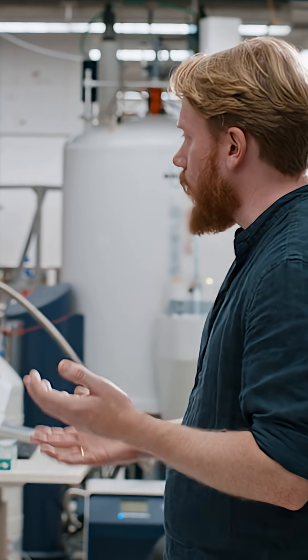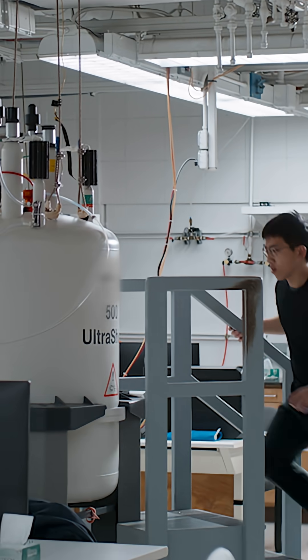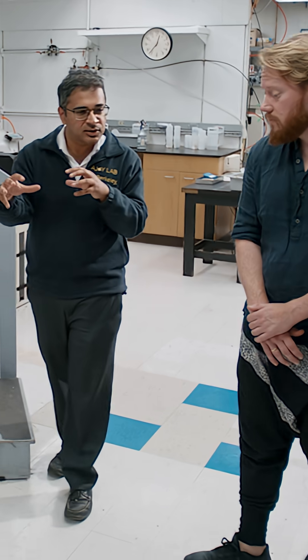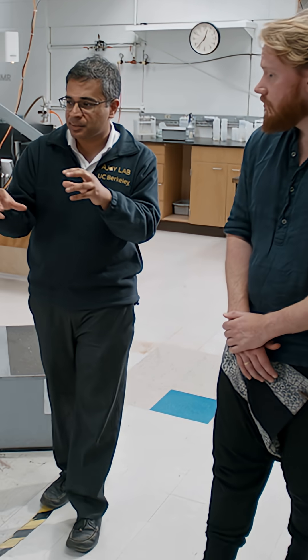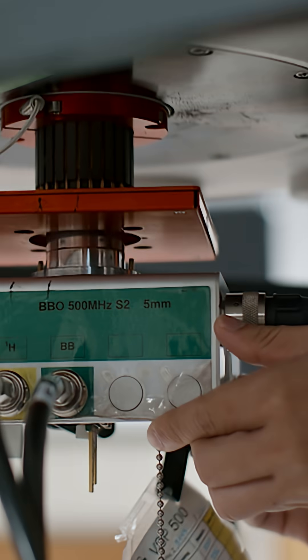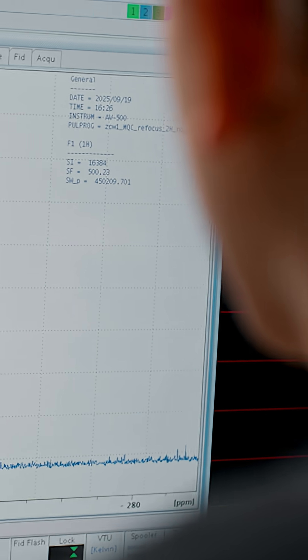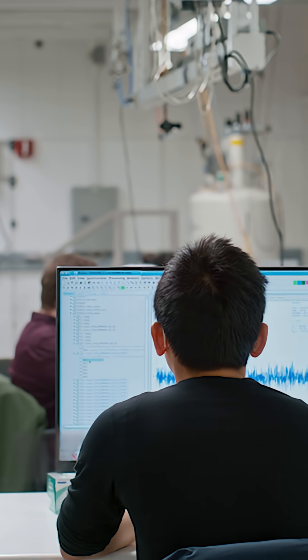How does an NMR spectrometer work exactly? NMR uses a large magnet that we see here. We put a molecule into this magnet and use the fact that the molecule itself is made up of small magnets. You can imagine that these magnets actually feel each other's presence, and by measuring how they feel each other's presence, we can map the structure of the molecule. The data produced from this instrument tells us how these magnets in the molecule talk to each other — it's a fingerprint of the molecular structure mapped by listening to how these magnets are interacting.